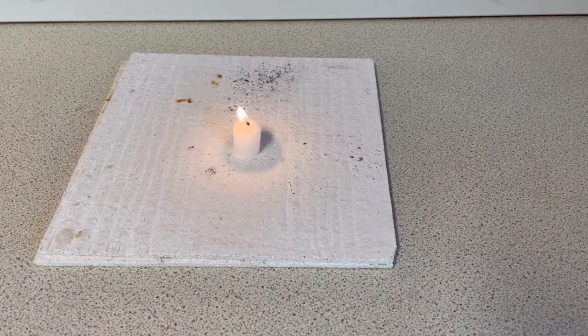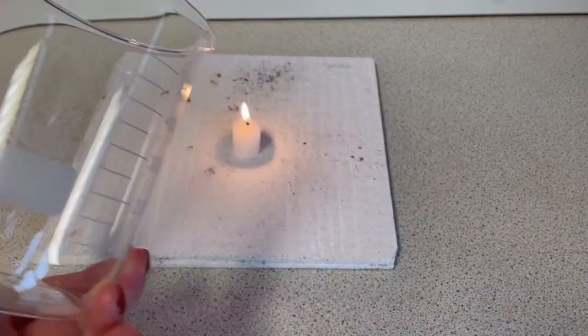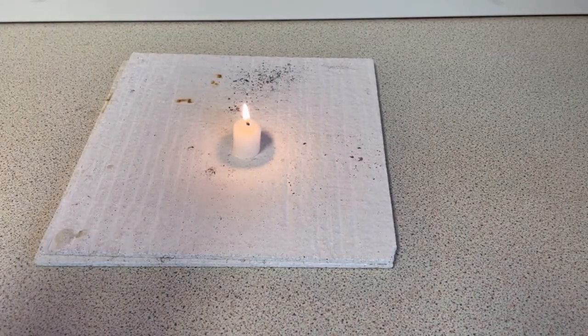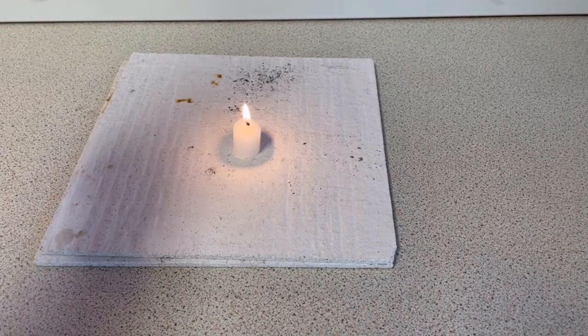So now it's time to carry out our first investigation. The first beaker we are going to use is the largest beaker we have today, which is a 500 milliliter beaker. I'm going to place this over that candle and time how long it takes for the candle to extinguish.